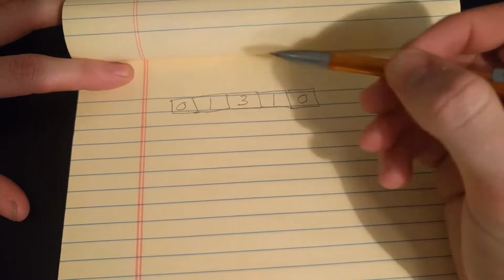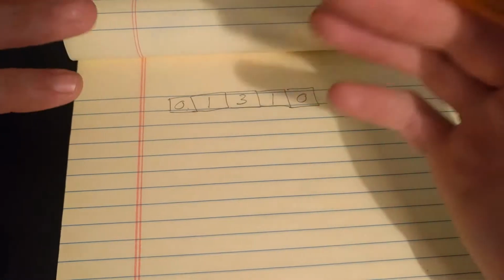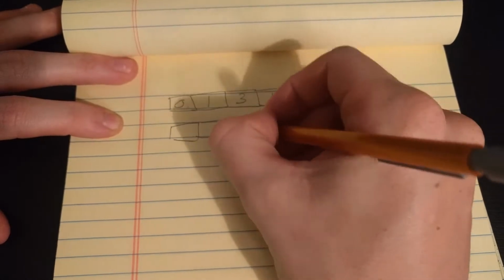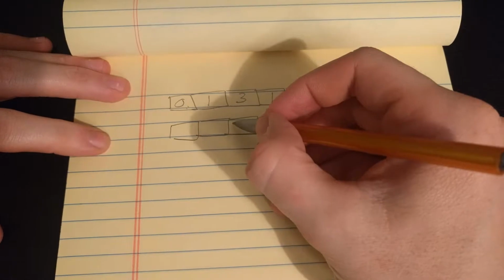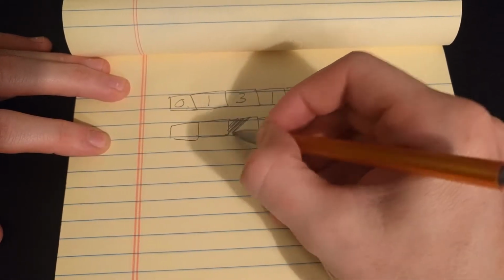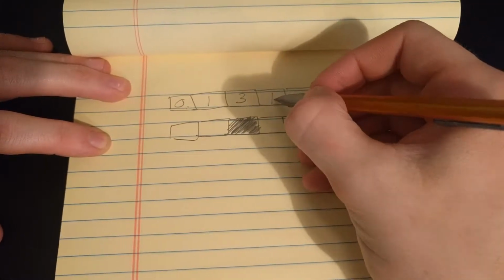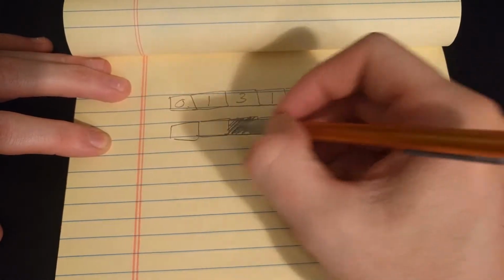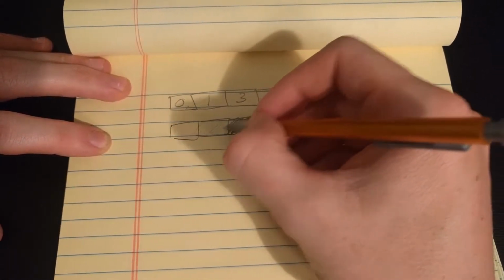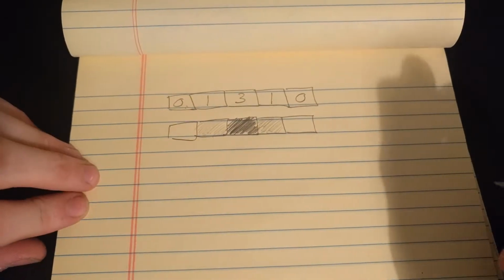And now, these numbers we can represent, instead of numbers, we can assign a sort of darkness level to each of these numbers. And by doing that, we can make a one-dimensional image of sorts. So it would look most dark at the center, like that, and then it would be a third as dark in the squares right next to the center, and then the squares next to those, it wouldn't be dark at all.